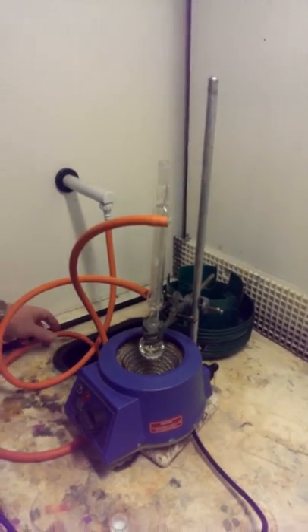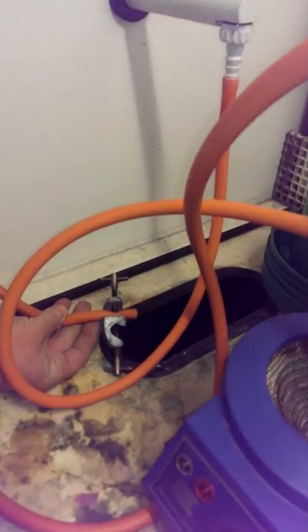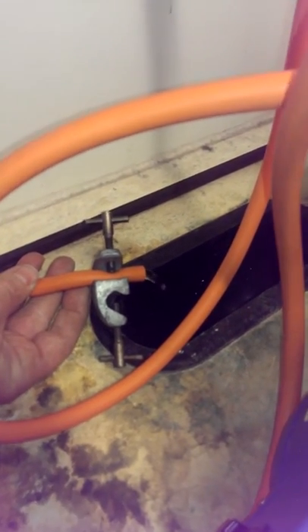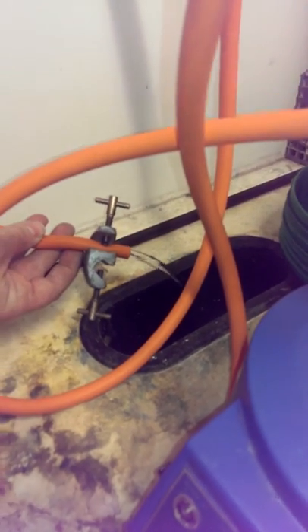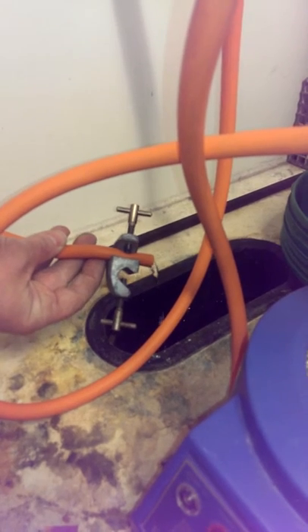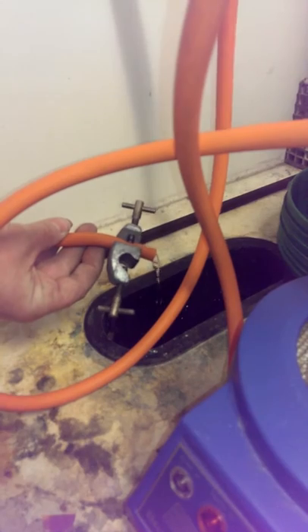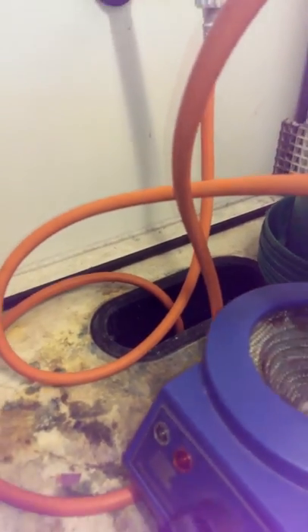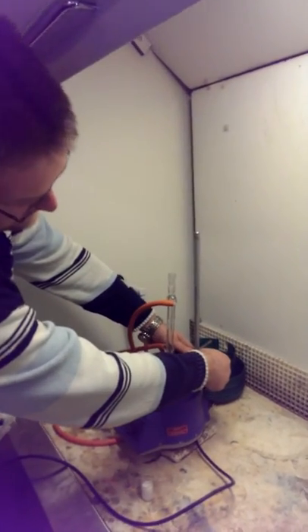That's fine. And now check the water rate; what we need is a trickle. A very gentle trickle, that's fine for our needs. What we don't want is a strong flow of water during the course of a reflux. That will mean certain flooding for one unlucky member of your group. So a nice gentle flow of water. If you're refluxing for a long period, just keep checking it after the hour to make sure that the water pressure hasn't dropped. And then drop down into position.